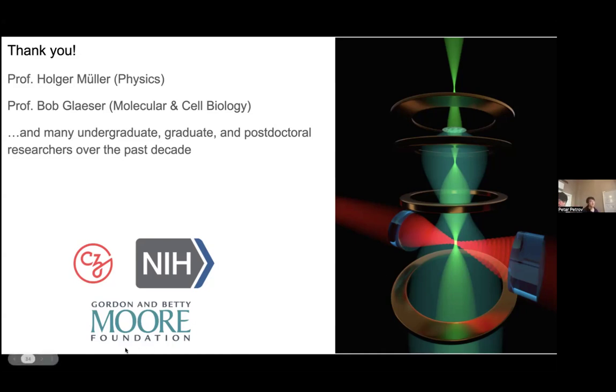Okay. This goes back to a slide from the beginning, but just so I understand: the whole point of this is to have phase contrast imaging, and the laser shifts it by half a wavelength. Is that right? And are you taking two separate images, one with the shift and one without, or what is the shift with respect to?